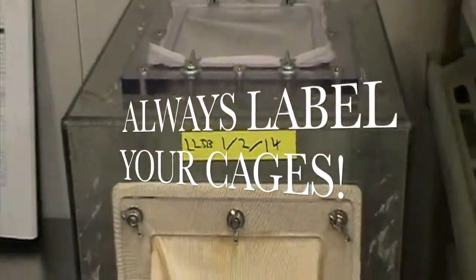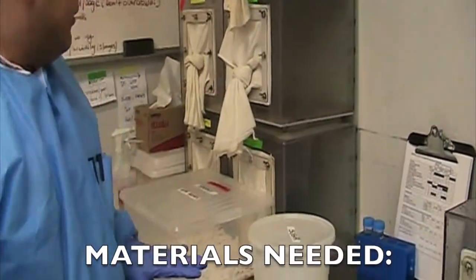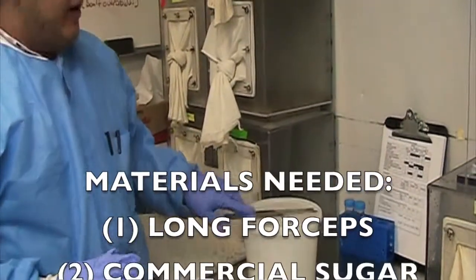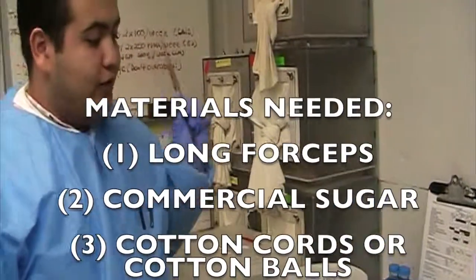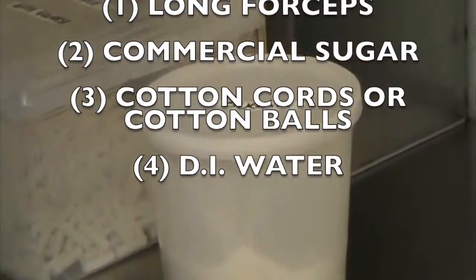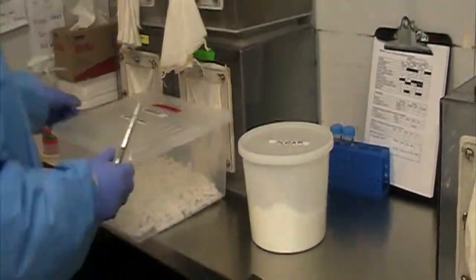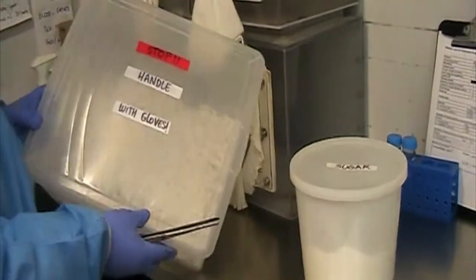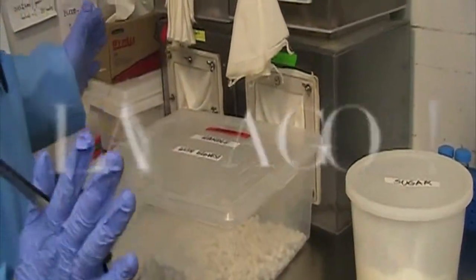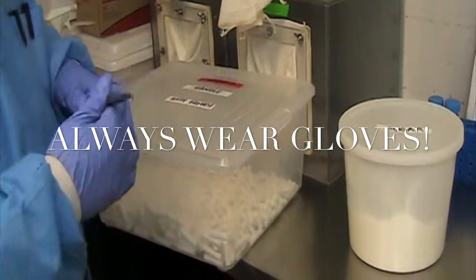The next thing I'll show you is how to use the cage and get the sugar water set up. The few things you need for the sugar water: you need long forceps, you need sugar — just regular commercial sugar you can buy at any supermarket — and then you need cotton cords. Make sure you always wear gloves. You don't want any bacteria carrying from your hand to the sandfly cage or anything.